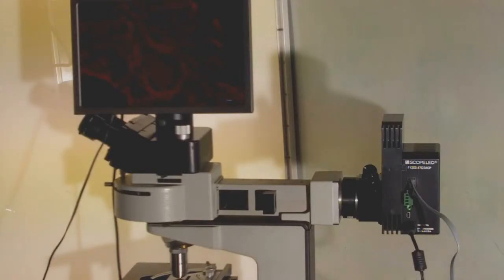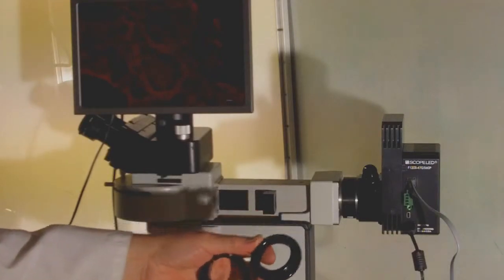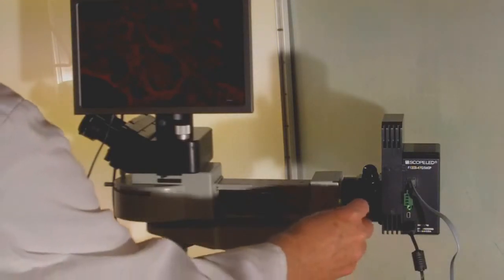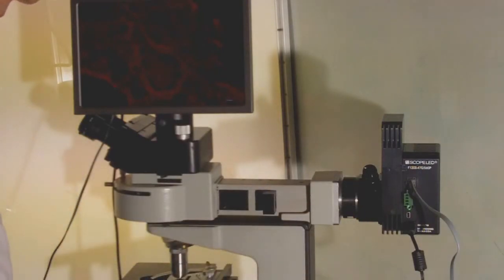It's very easy to adapt with these adapter rings that we use. This is one for a Nikon. This is one for the newer Leitz microscopes, bayonet flange. They simply attach to the front here of the F-Series Scopeled based on the type of microscope that you have. Call Bunton if you have any questions about the Scopeled F-Series LED illuminator made in America.